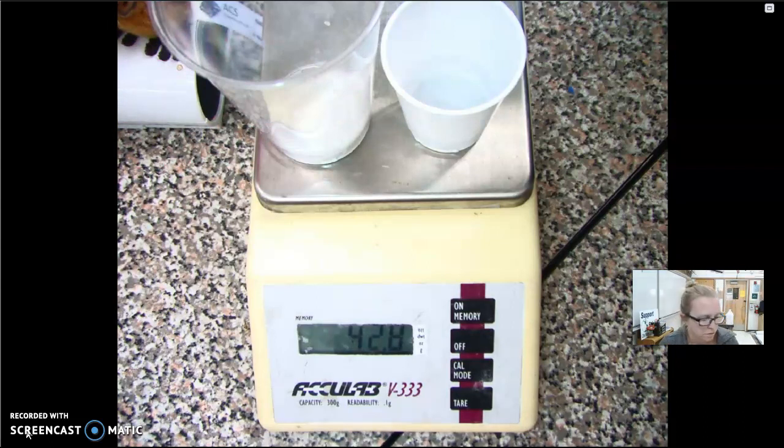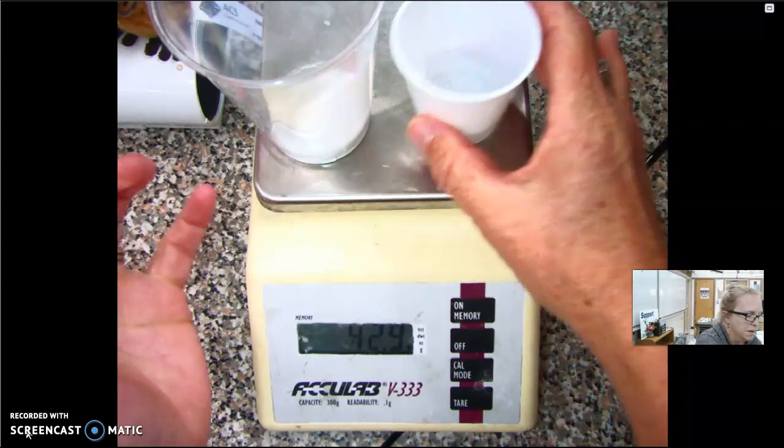So you're going to record the initial mass. So this again is grams, 42.9 is our initial. Pour the baking soda into the beaker with the vinegar. I'm pouring the vinegar into the baking soda because that's how I set it up, and it doesn't really matter. So here we go.